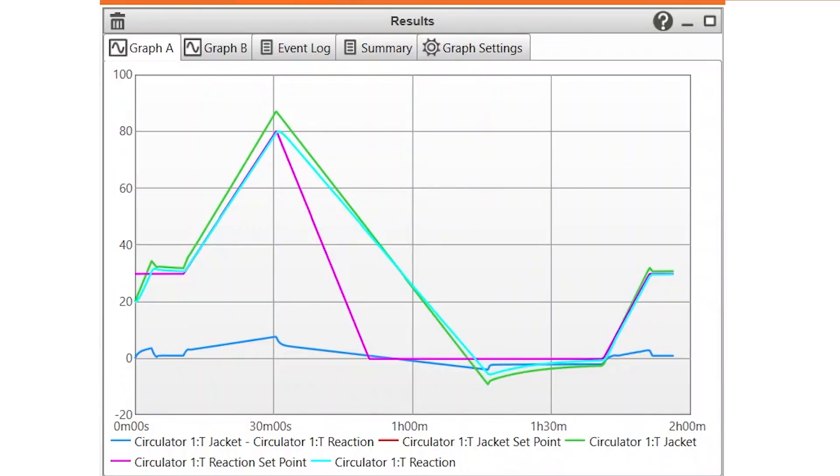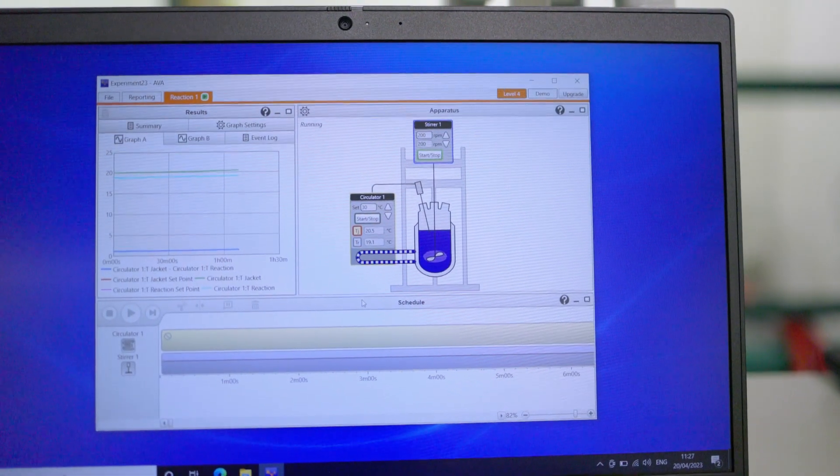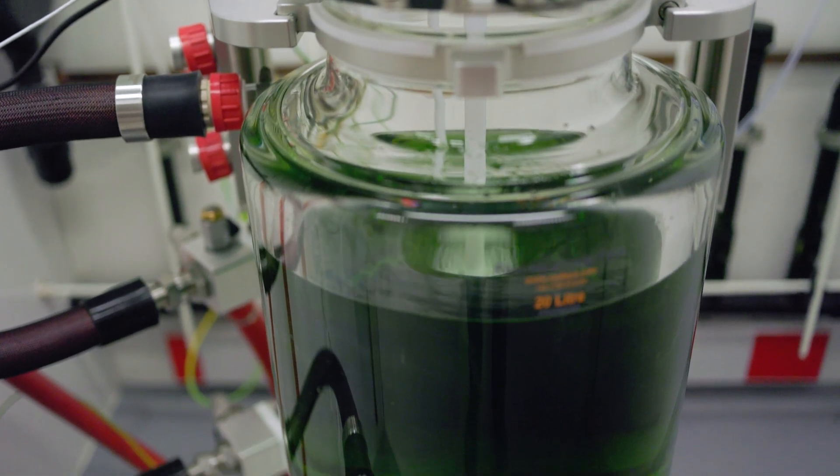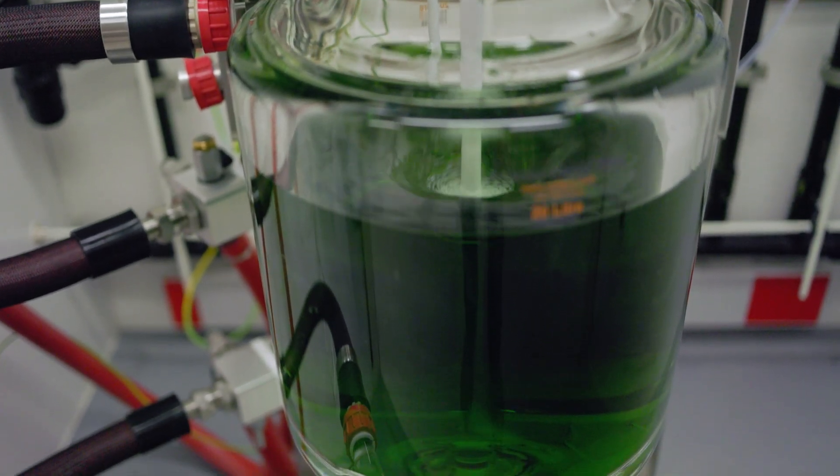What I quite like is looking at the heating cooling rate, which should give me a rough estimate on exotherms and endotherms, which allows me to compare what I've been doing on the small scale to the larger scale, so from round bottle flasks right the way up to the jacketed vessel, which might have a different shape of stirrer and just different way of heating and cooling.